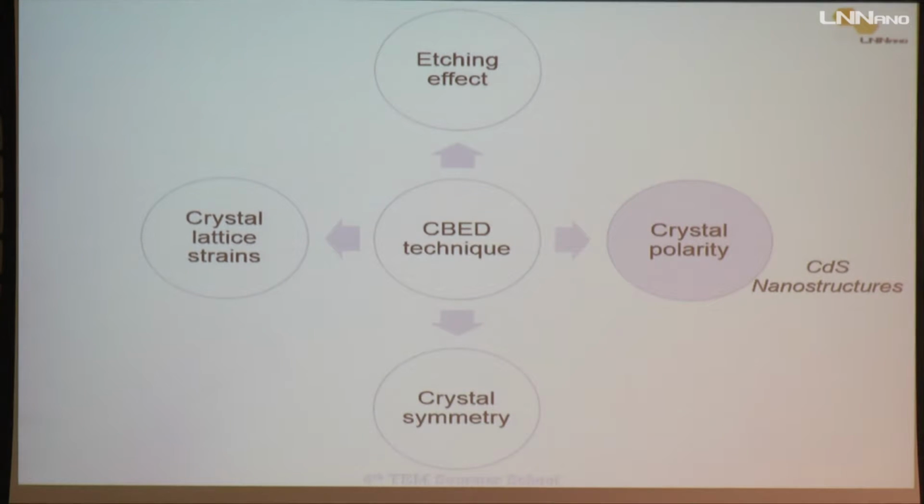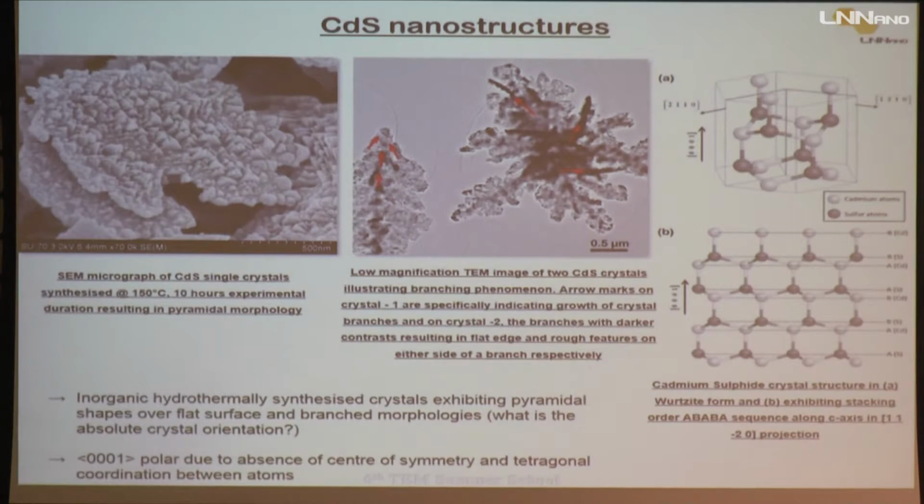So the next application is crystal lattice polarity analysis. For this, I tried to use cadmium sulfide nanostructures, and these are hydrothermally synthesized cadmium sulfide nanostructures.